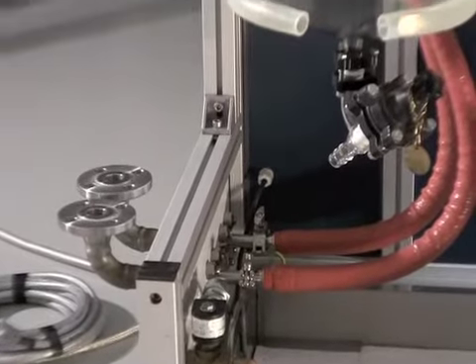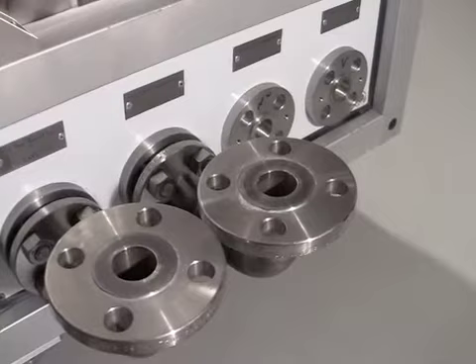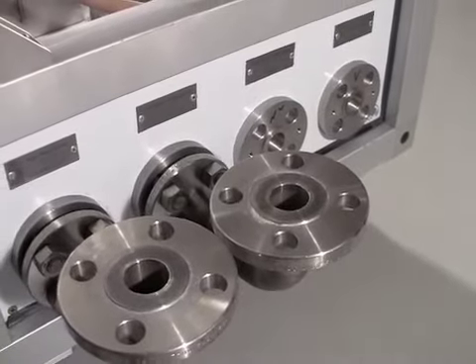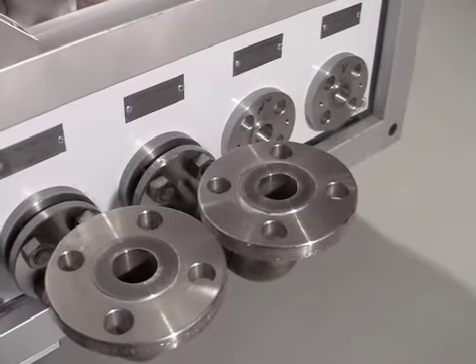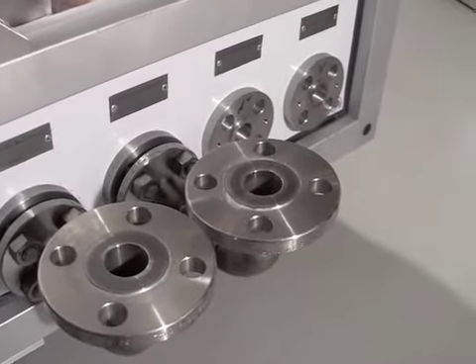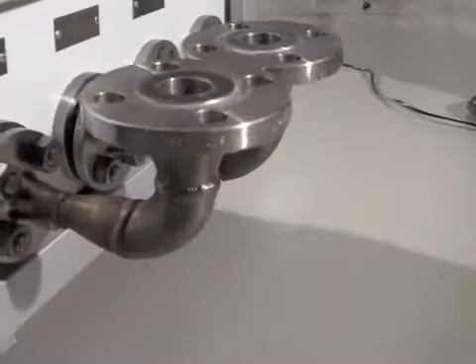Here you see the utility panel. This utility panel can come standard with hose barb connections or tri-flange connections as you see here. These flanges allow you to bolt any compatible fittings directly to the panel.